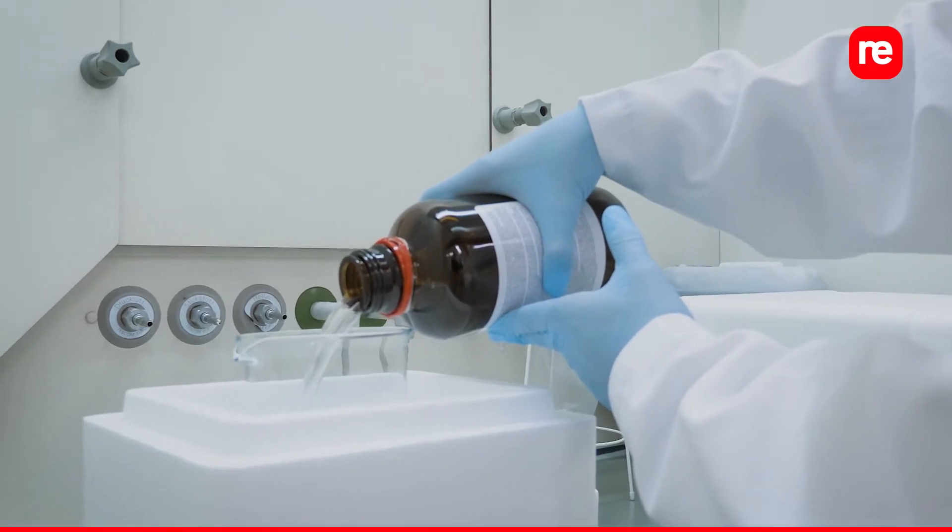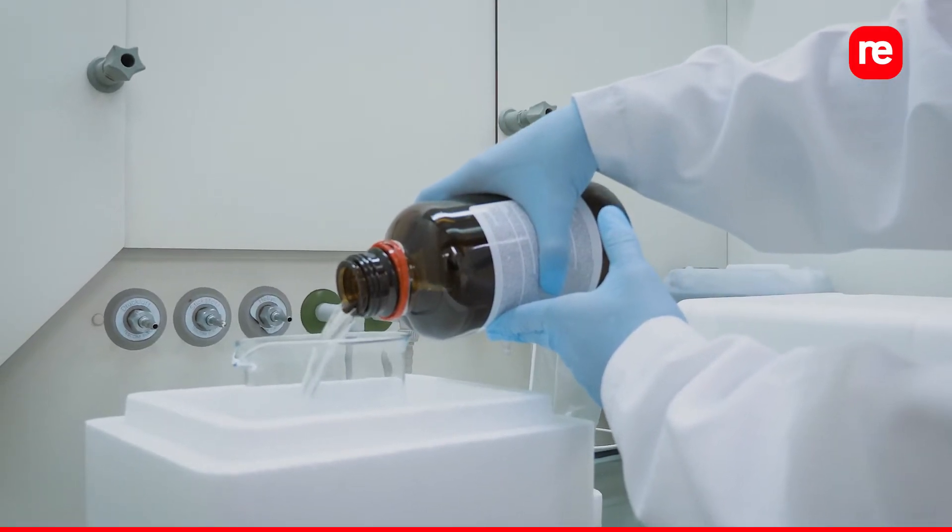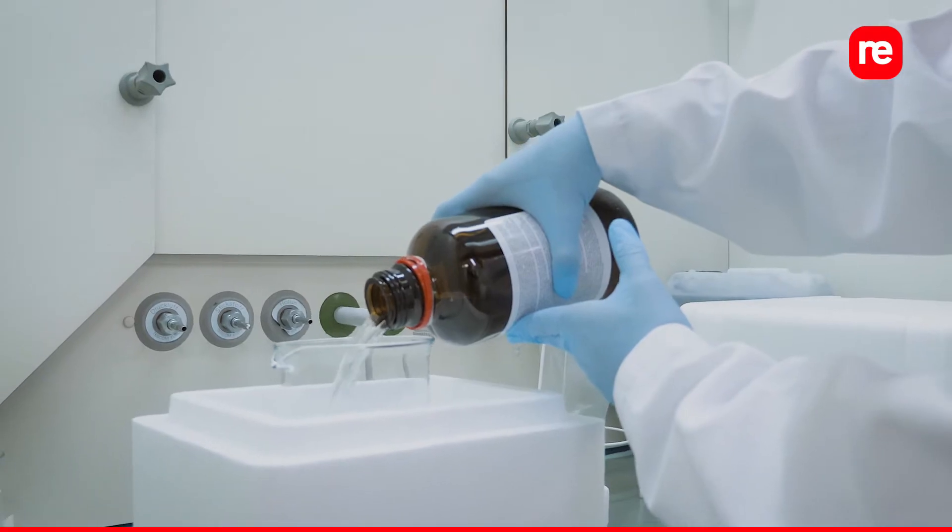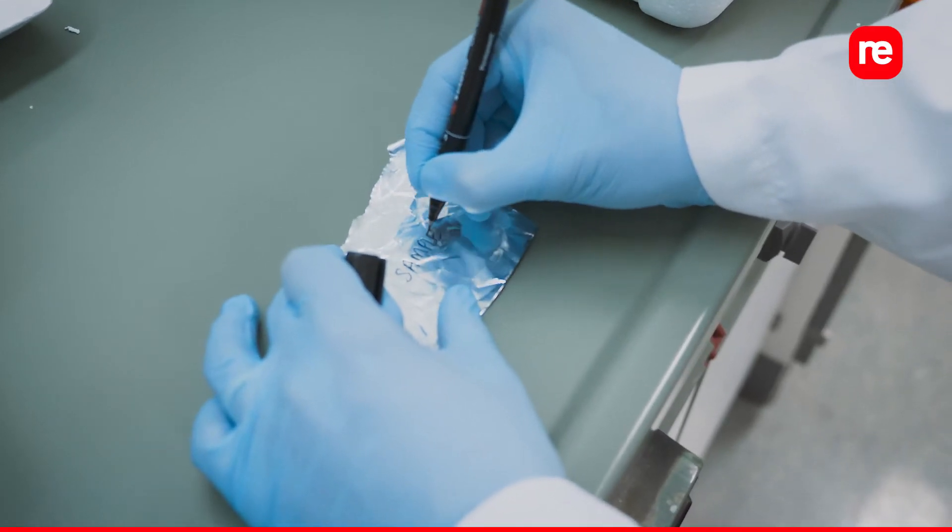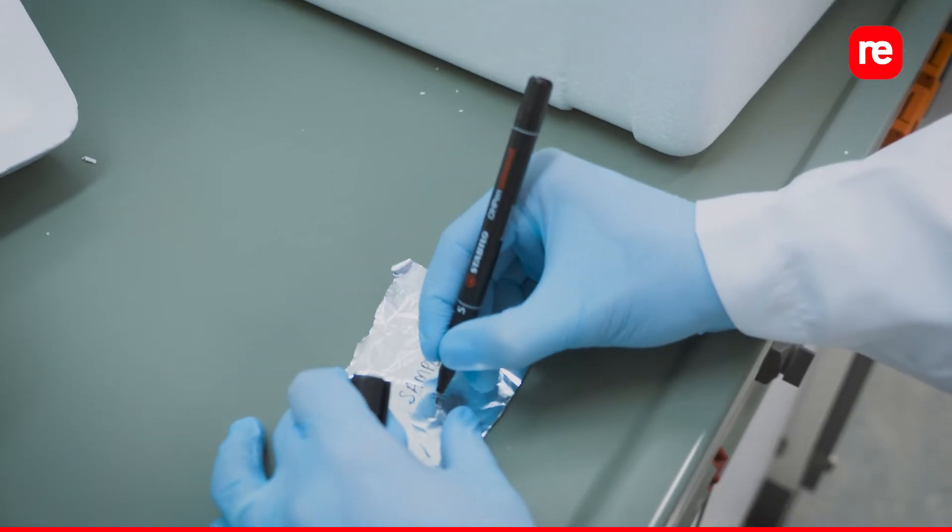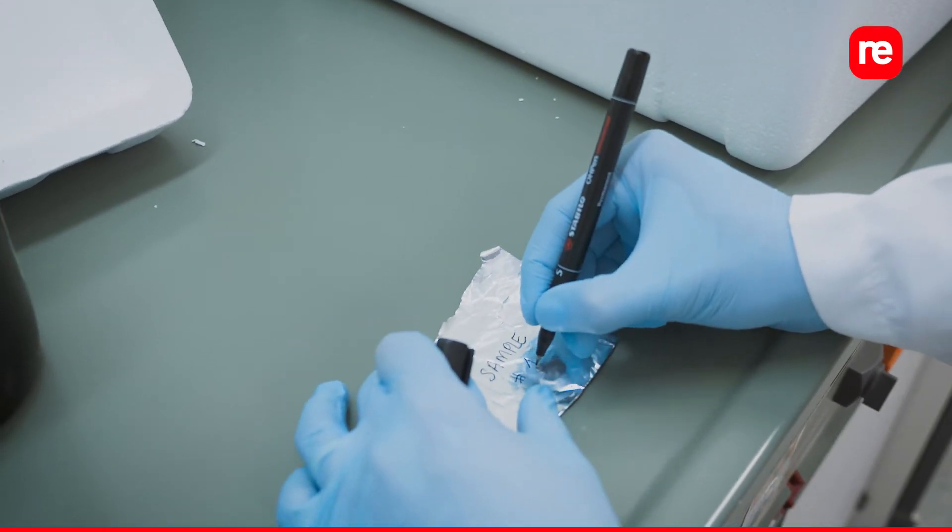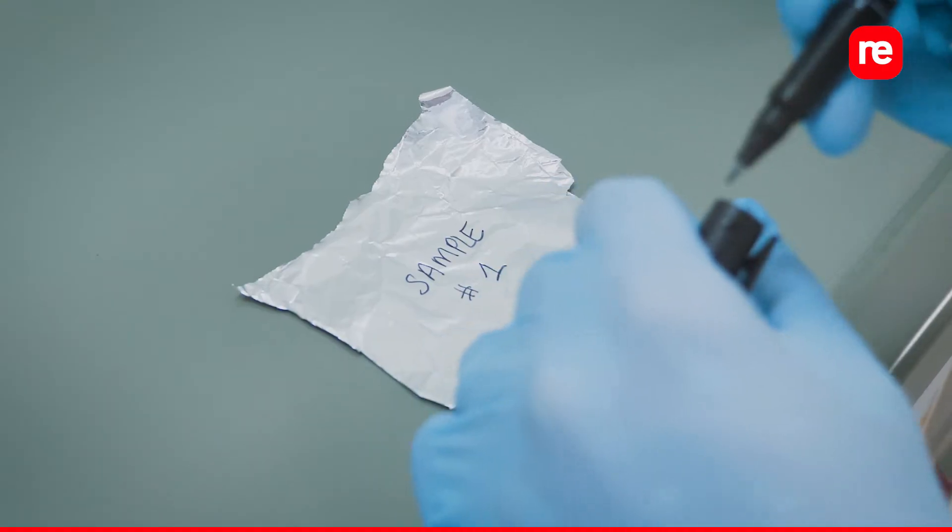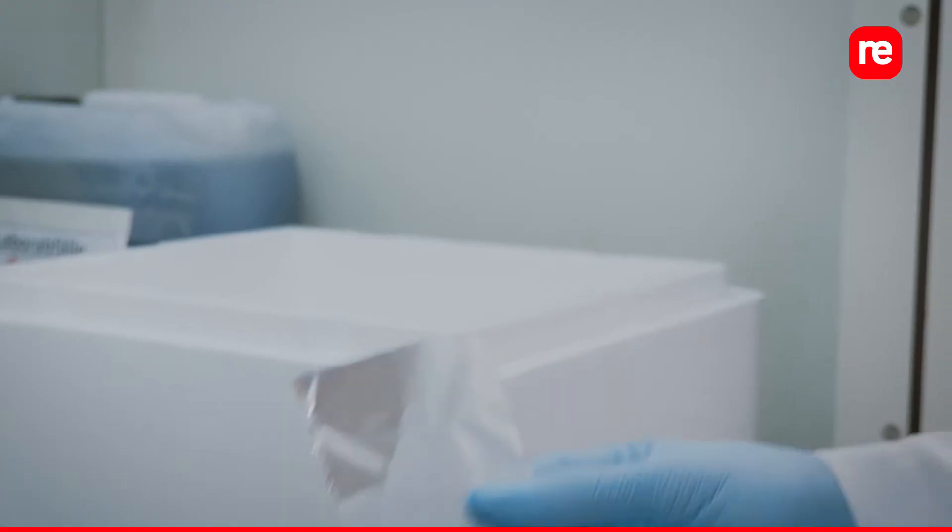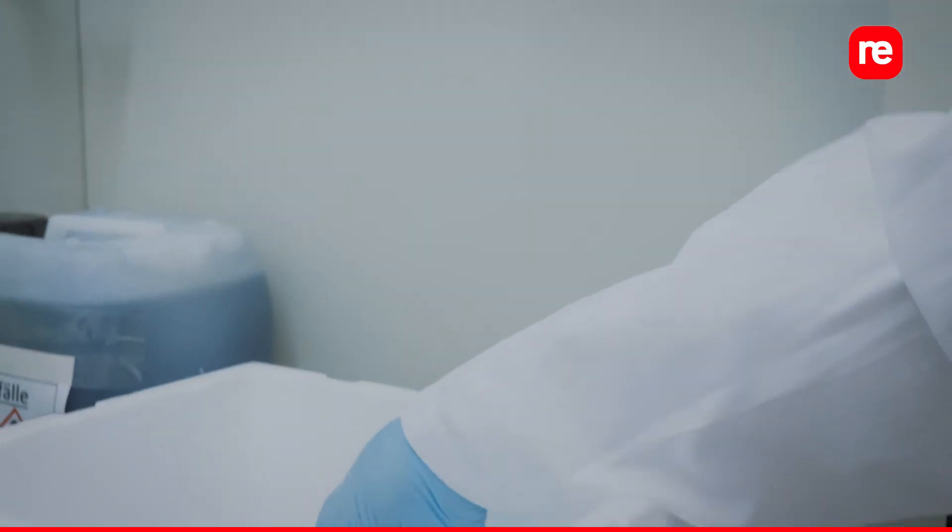Fill the bottom of the beaker with isopentane to around 3 or 4 centimeters high. Meanwhile, prepare pieces of aluminum foil and label them with sample information. Keep them cold on dry ice. These will be needed to store the samples after freezing.